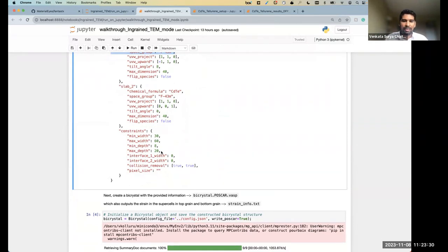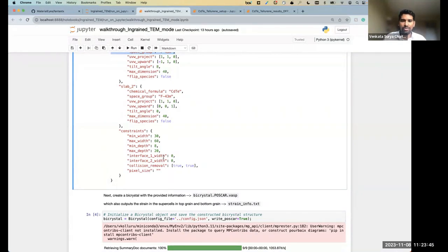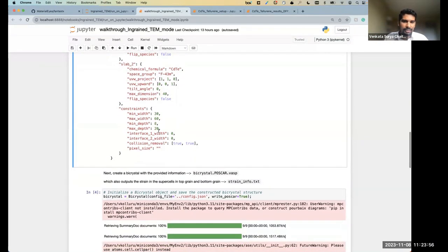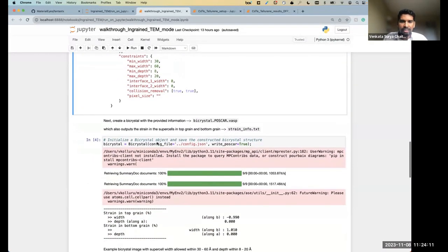But if we want to perform DFT calculations or other theoretical simulations with the structure, we want to be careful with the size. If you go beyond 30 or so angstroms, the number of atoms will be in the hundreds, like 500 or 1000 atoms, which is impossible to do DFT calculations with. We also need the pixel size. Again, this can be optimized, and a rough value is enough, but the metadata in the DM3 file will be used in this particular case.